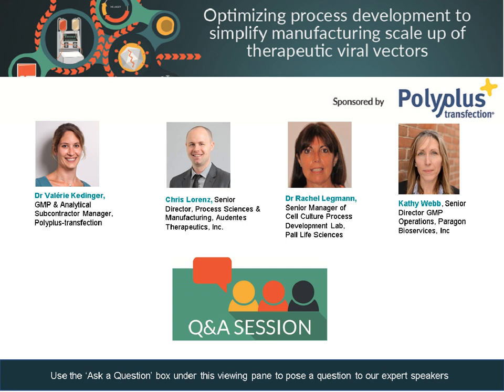But I definitely think that upstream sometimes is a bit of the limiting factor to generate enough material for our downstream processing. So anything that we could do to achieve better titers would be a great improvement.